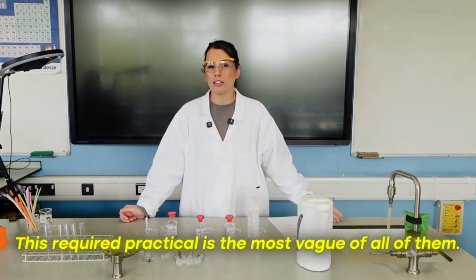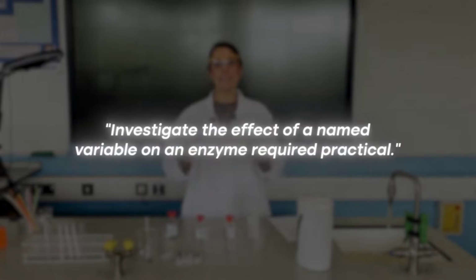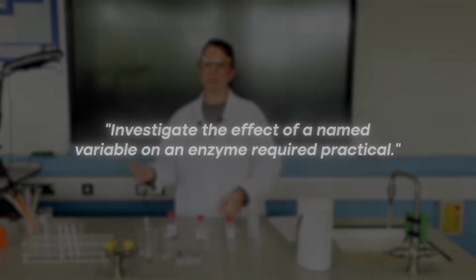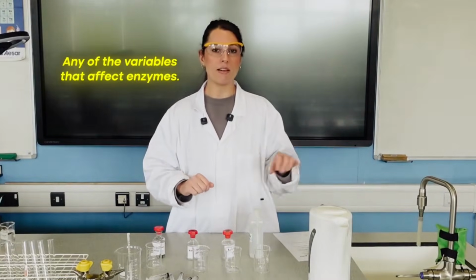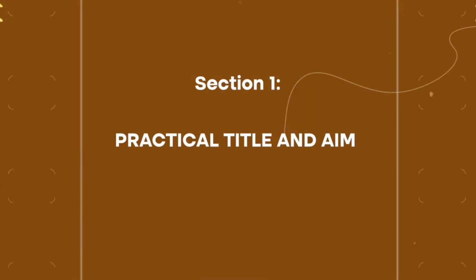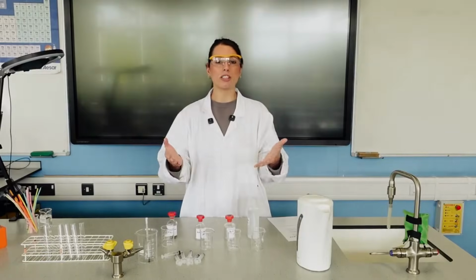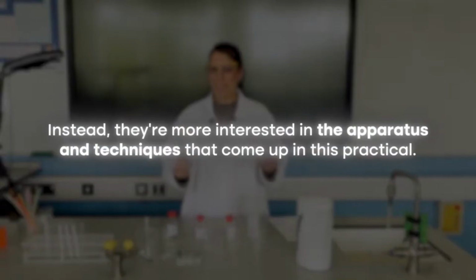Now, this Required Practical is the most vague of all of them because it just says investigate the effect of a named variable on an enzyme required practical. So there isn't an exact method that you need to know for this because it could be any of the variables that affect enzymes and any enzyme controlled reaction. And for that reason, you don't usually see in the exam a question that is noticeably visible as Required Practical 1. And instead, they're more interested in the apparatus and techniques that come up in this practical.